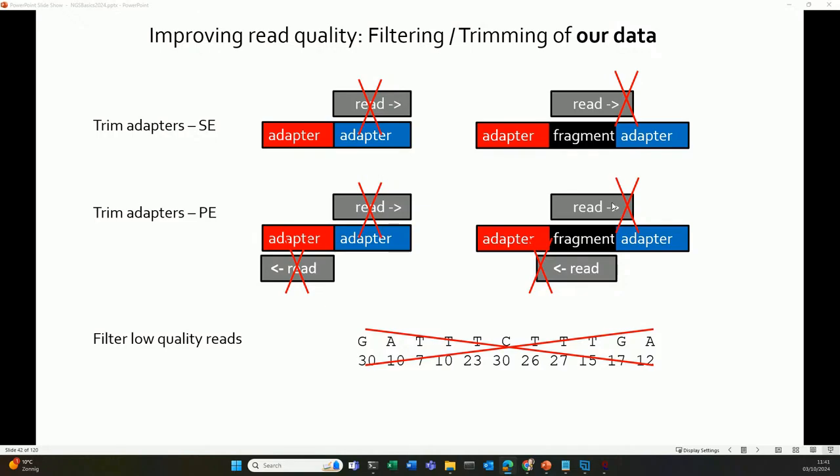So you have a lot more information. The part that is okay is reverse complements. The part that is adapter contamination is not. And the parts that are adapter contamination should have the same length. That's a lot more information. So here, with paired end data, you can remove very small adapter contamination. In single end data, you cannot. It needs to be big, so you're 100% sure that it's really adapter.